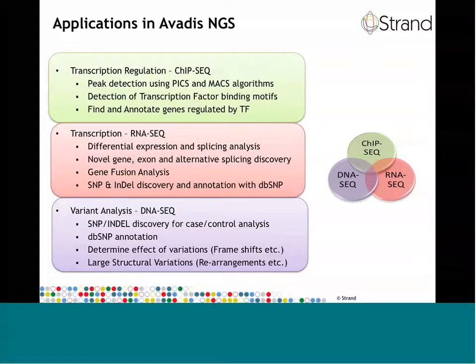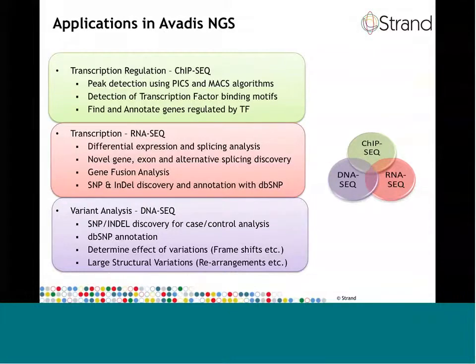For a transcription factor, this can be followed up by looking for potential binding motifs in and around those peaks, using motif detection algorithms such as GADEM. In addition, the genes that are close to the detected peaks are good candidates for being regulated by those transcription factors and can also be detected. The gene ontology and pathway analysis tools can then be applied to learn more about these sets of regulated genes and their respective targets.